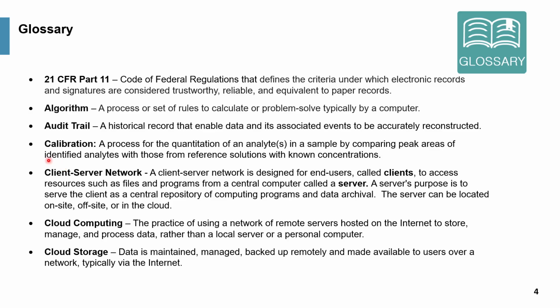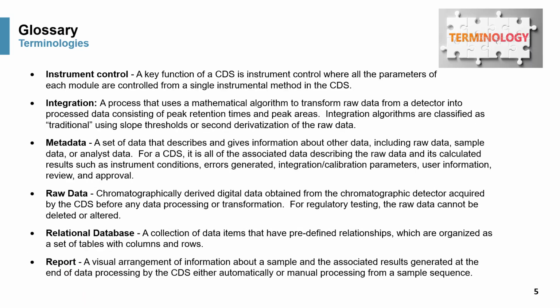Calibration is the process to quantitate and analyze using a calibration sample or reference standard. I mentioned that most pharmaceutical companies use the client-server network because of compliance and also for data archival and other terminologies. In addition, we talk about terminologies such as instrumental control, the integration process, metadata, which is a set of data that describe and give information to other data. It's not actual raw data, it's meta, something like that.